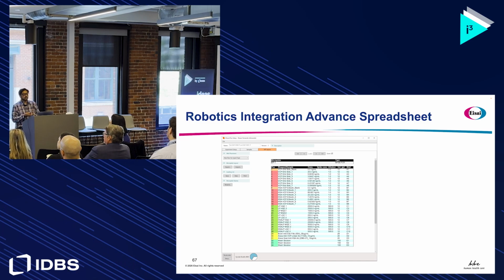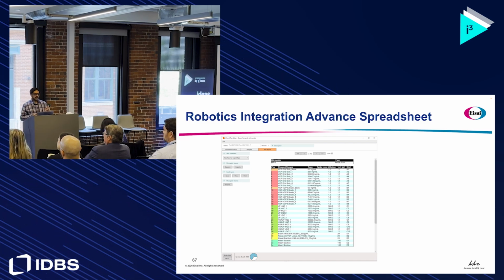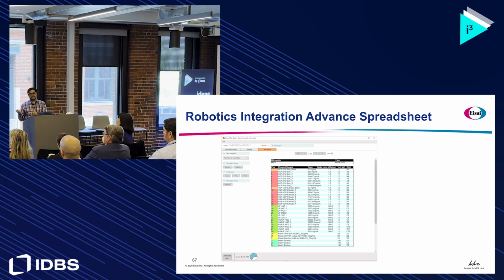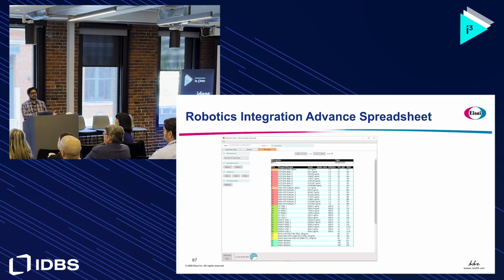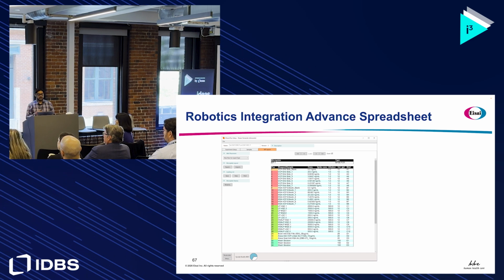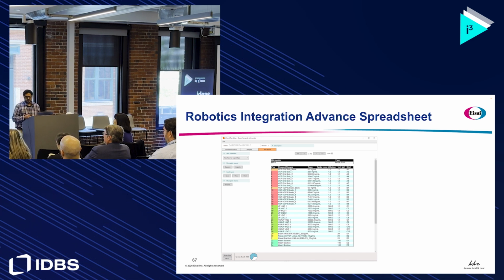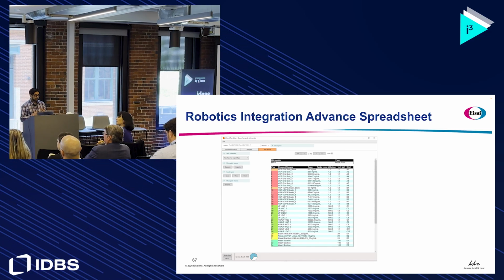This is where E-Workbook falls in this whole big scheme, right? In the gyros, it needs to tell us where it wants its samples to go so it knows and it can execute all the assay steps for you. So it'll tell you the location on that PCR plate it wants, or the volume it has, the dilution scheme that the samples need to be diluted.